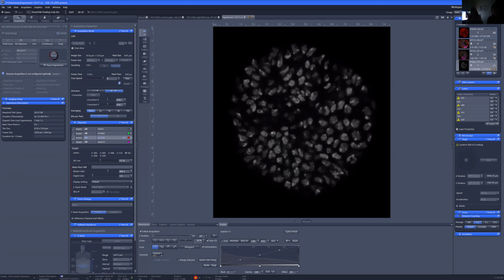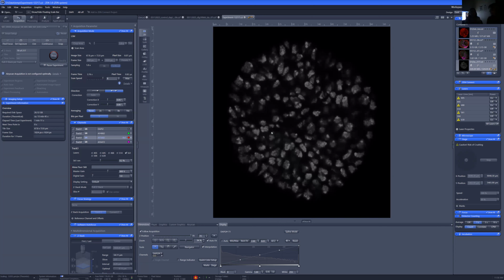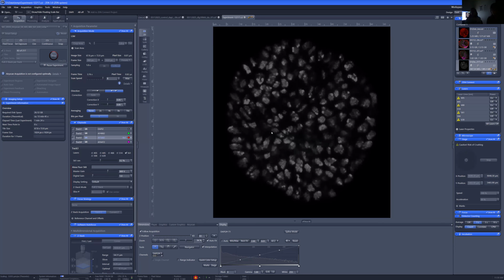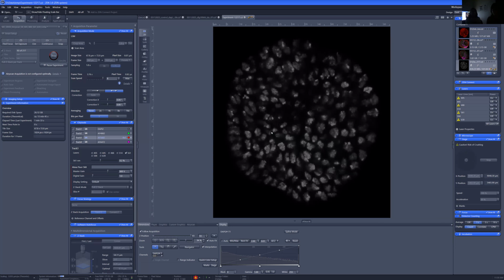basically I have started the acquisition, and the computer and the microscope are now working together to image first the DNA in all of the cells. This is kind of equivalent to those images I used at the very beginning of my presentation yesterday to show you that you can't get a lot of information from the ovary by just looking at the DNA, but it is really helpful to have pictures of what the DNA looks like because it tells you where the cells are.